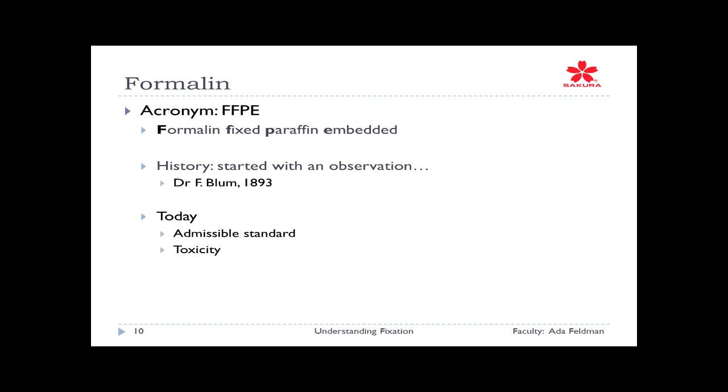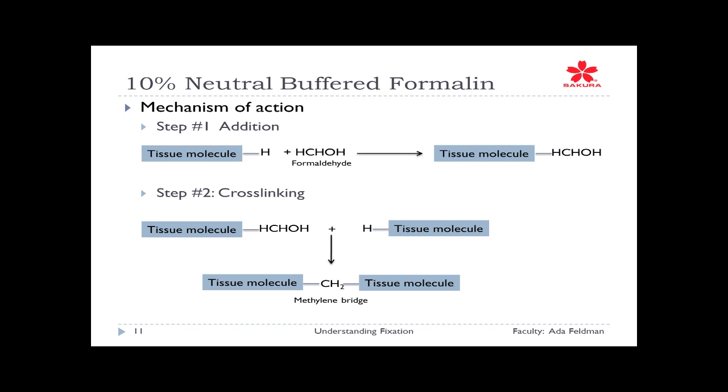So, but let's take a look at it. Let's find out what it is really doing to our tissues. Because I told you we need time. Once that tissue gets in, we've got to give it time to chemically react. So what are the chemical reactions of 10% neutral buffered formalin?